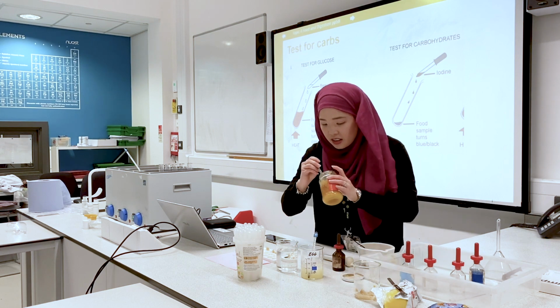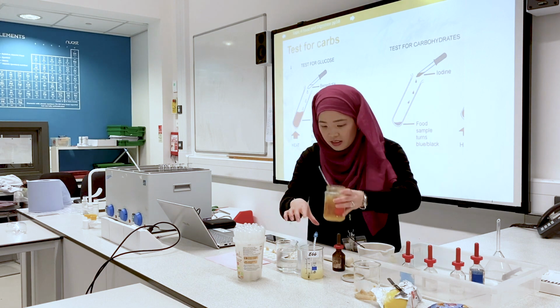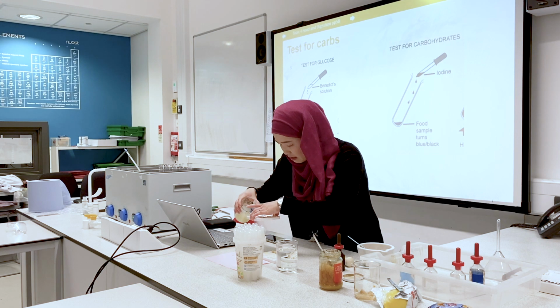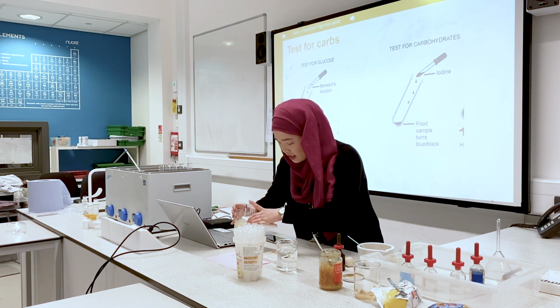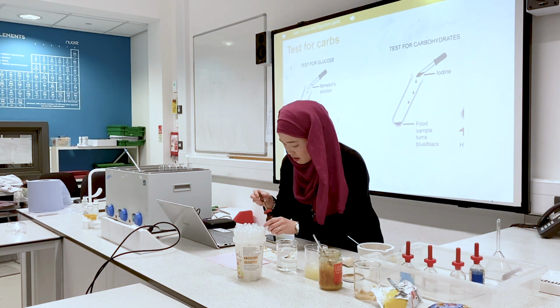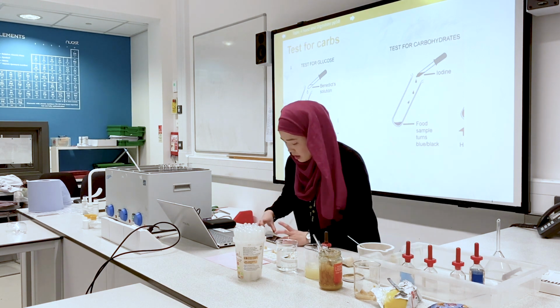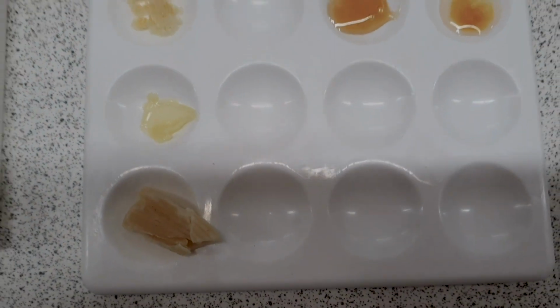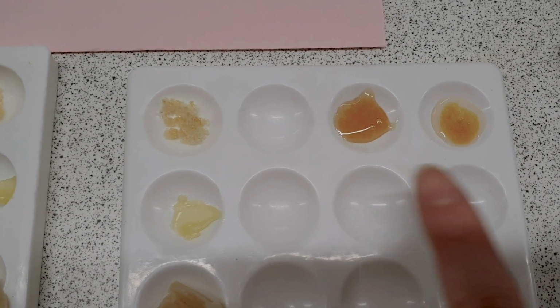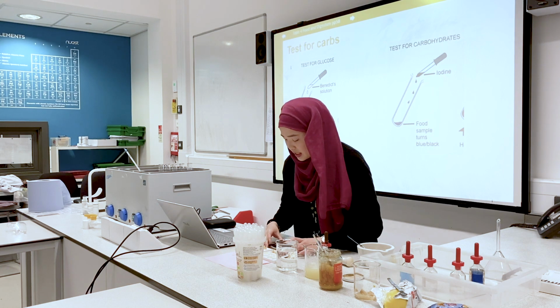Honey and egg. And you can see that there is a negative result with honey and egg. It has not turned blue or black. So that is a negative result.